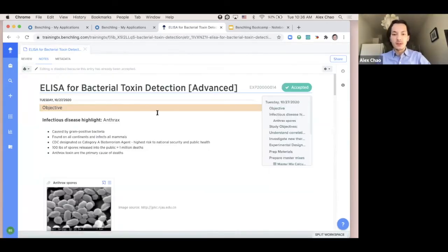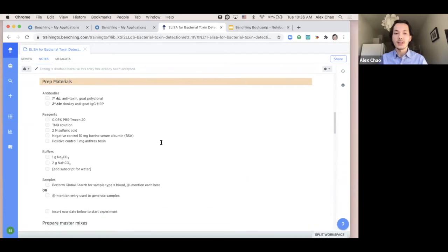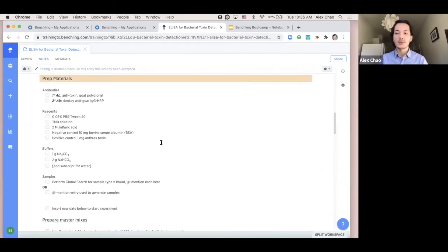Wonderful. So now that we've covered the witness and review program, which again is an important part of users on Benchling maintaining 21 CFR Part 11 compliance, we'll now walk through notebook templates. If you'll remember from our notebook basics session, I previewed how, when walking through the exercises of this particular notebook entry, this entire entry was pre-populated as a template. So I'll now show how you're able to manage permissions and organize your templates and also to create new ones.